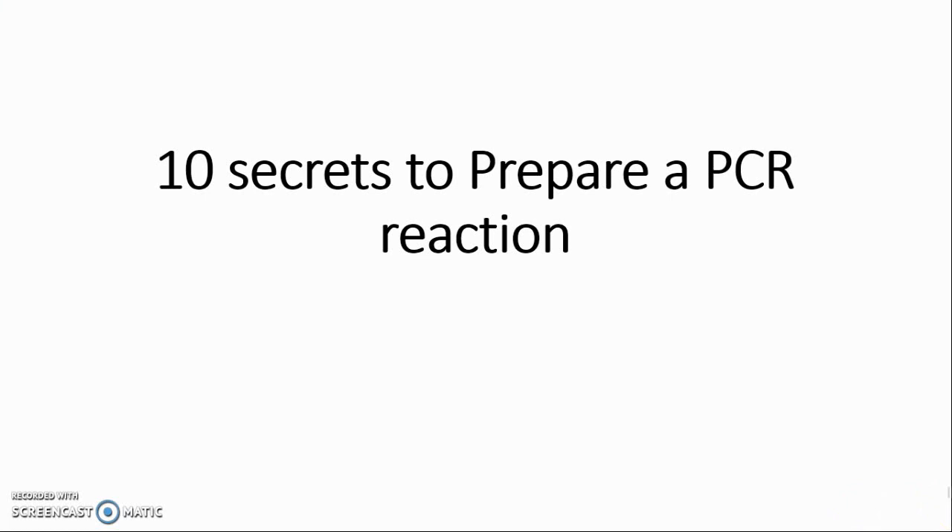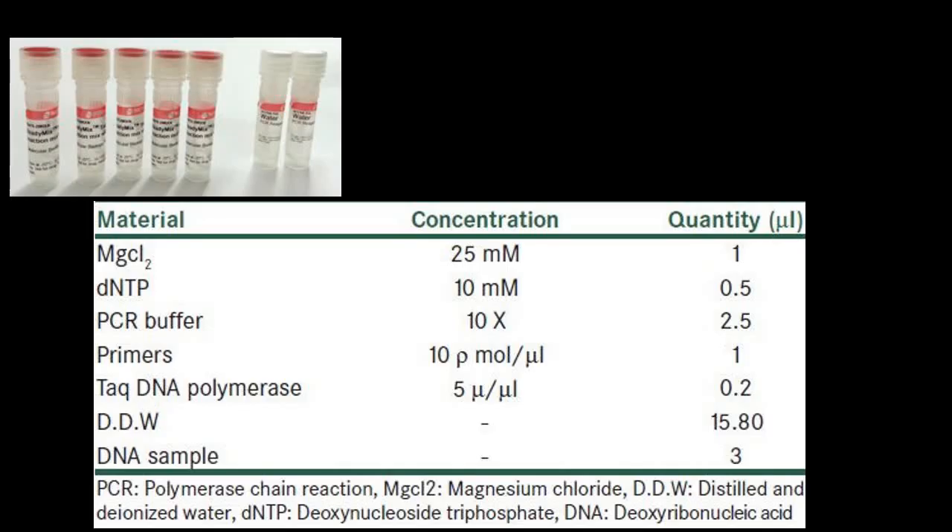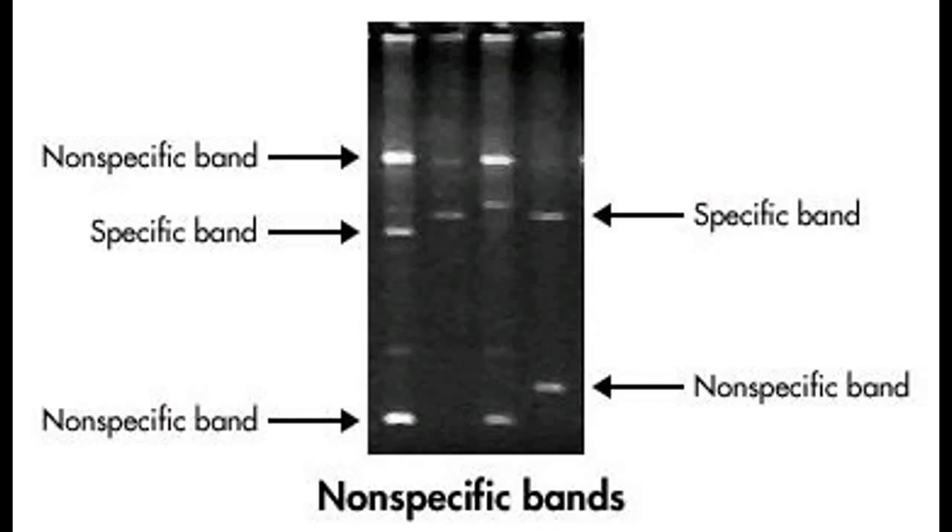10 Secrets to Prepare a PCR Reaction. Preparing a PCR reaction is one of the important steps in PCR amplification. Taq DNA polymerase, dNTPs, PCR reaction buffer, PCR primer, and template DNA are important ingredients of a PCR reaction. Preparing a perfect PCR reaction is key to successful amplification — not just amplification, but specific amplification. We don't want unwanted DNA bands and primer dimers. Primer dimers are the foe of the PCR reaction.